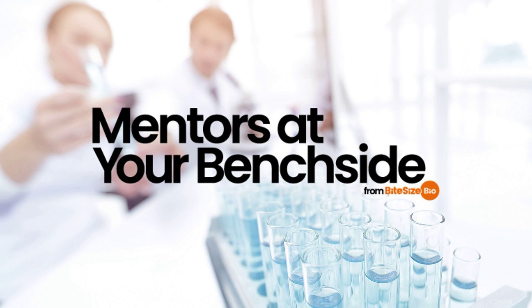Particles on electron micrographs lie in all manner of orientations. These orientations must be divided into classes, and then each particle that is to be included in the analysis is assigned to a class. Simple. This can lead to bias, particularly so when the assignment is manual, but it also occurs when the process is automated because a human being wrote the program, although deep learning algorithms may ameliorate this. A concerning consequence of this is that researchers may end up with an electron density map that contains features that aren't in their sample. From there, it's a slippery slope to drawing incorrect conclusions.